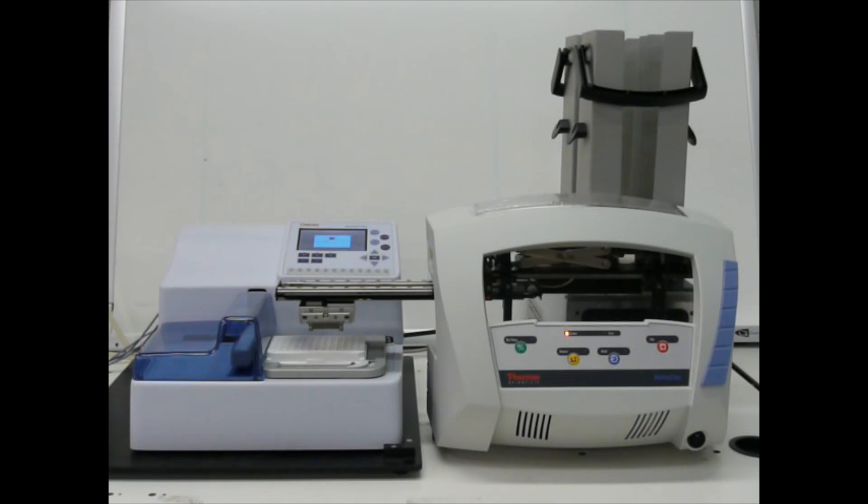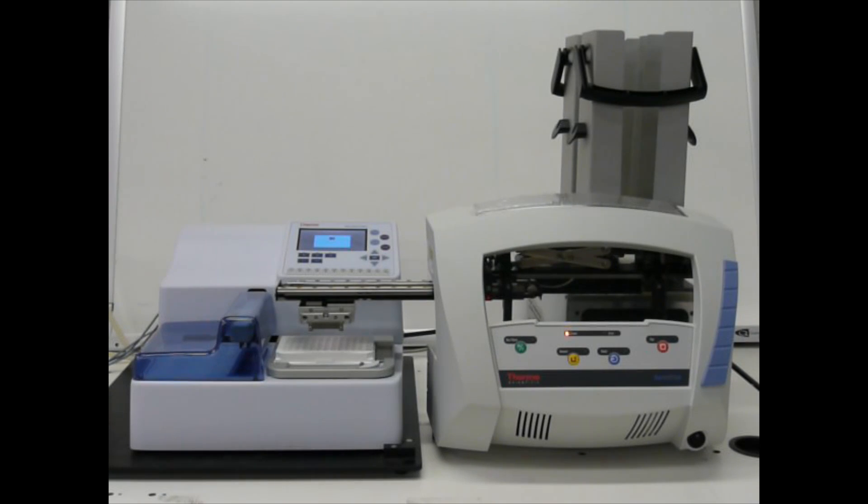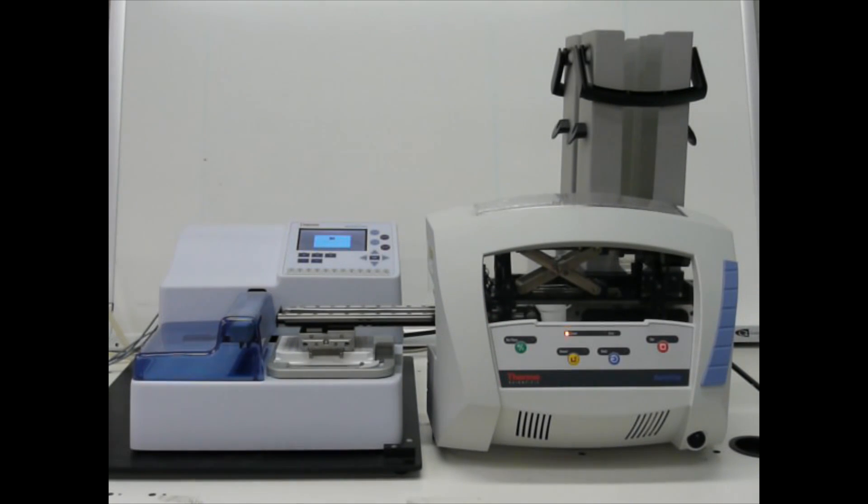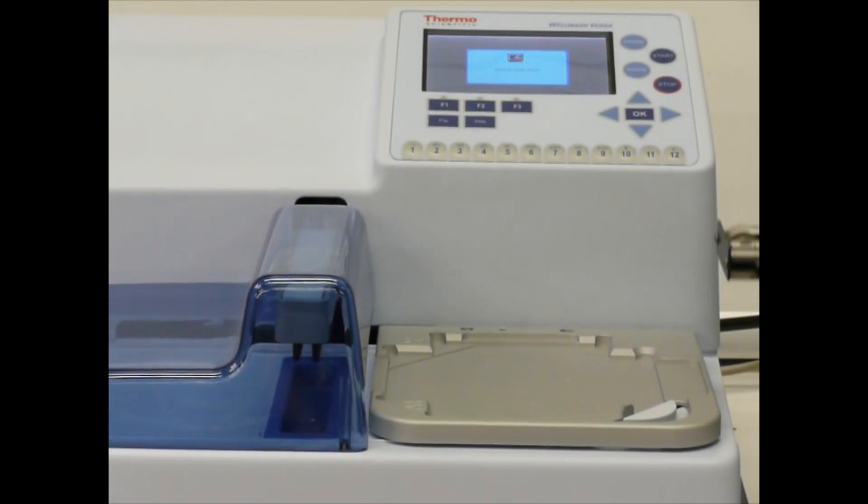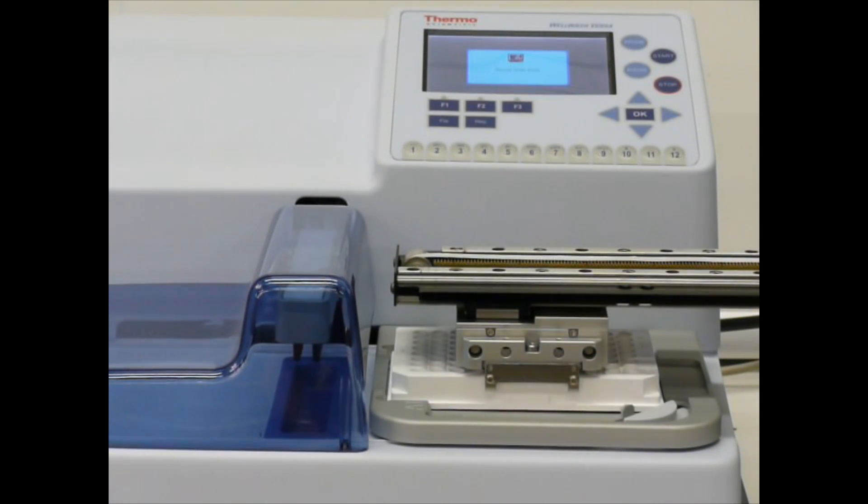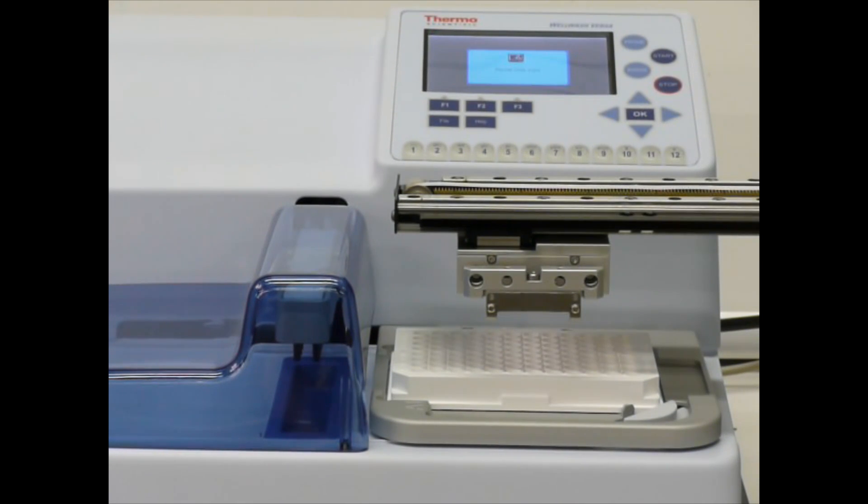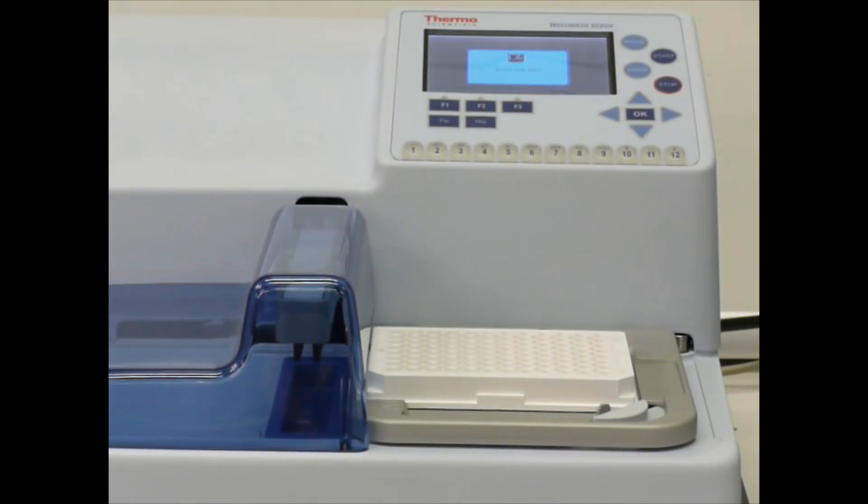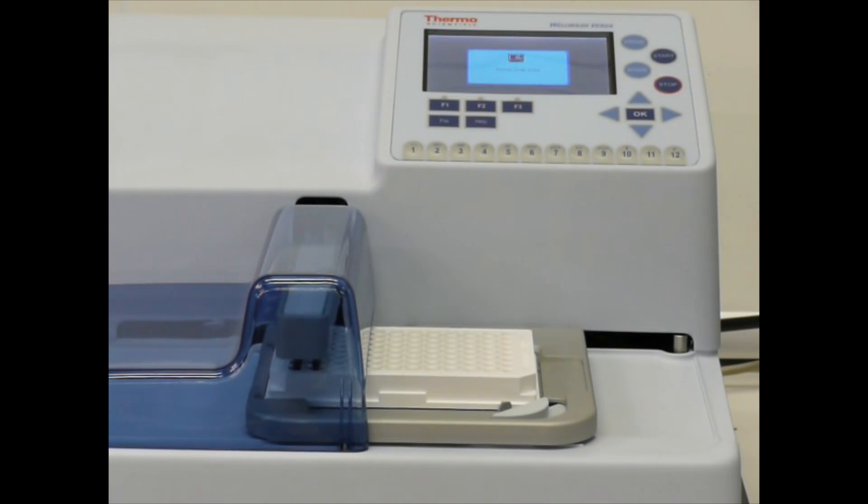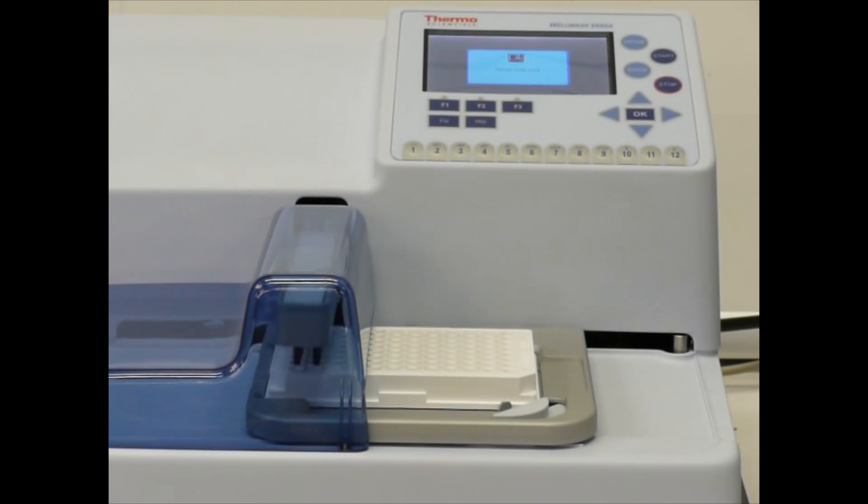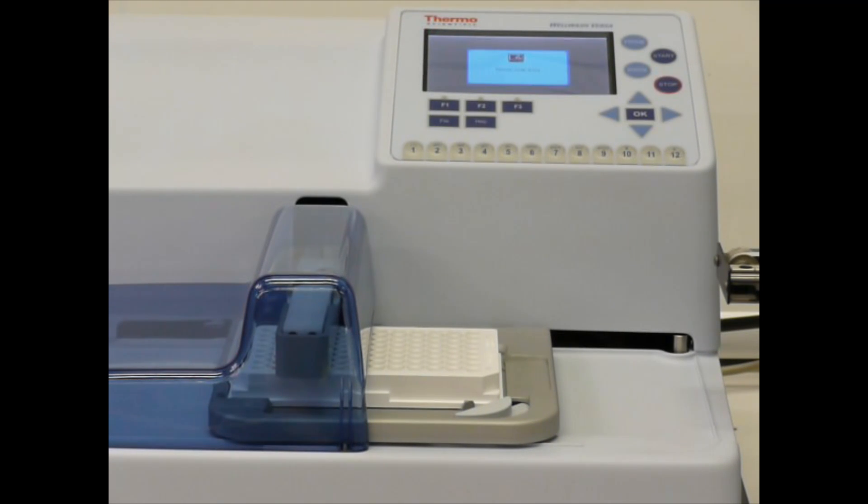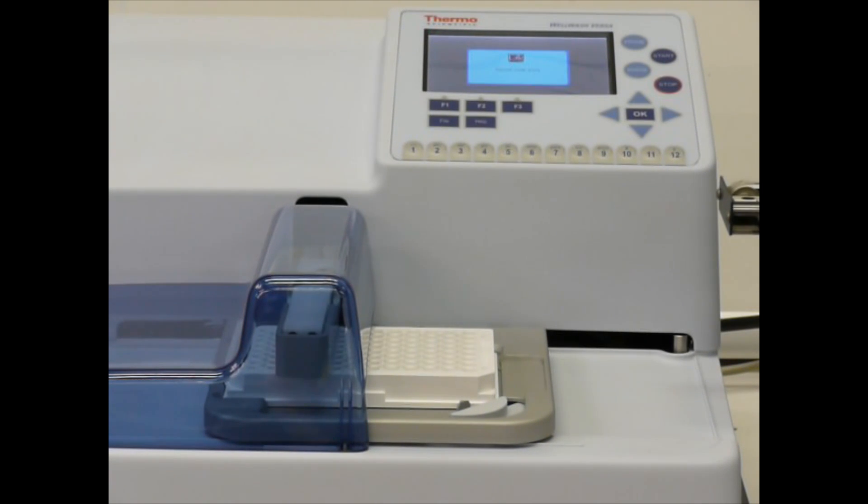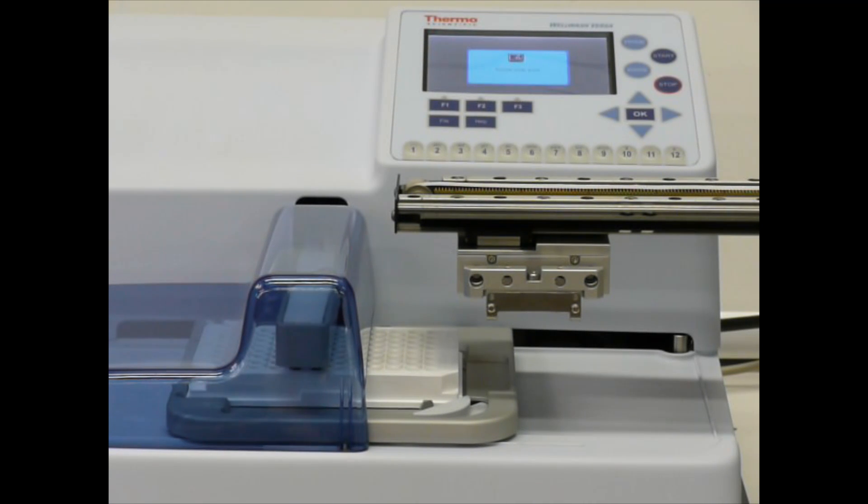Now, let's take a close-up of the RapidStack loading the Versa. Here we see the RapidStack loading the WellWash Versa. The WellWash Versa is running Protocol Wash 1. In this wash sequence, I've pre-determined that I'd only want half the plate to be washed.